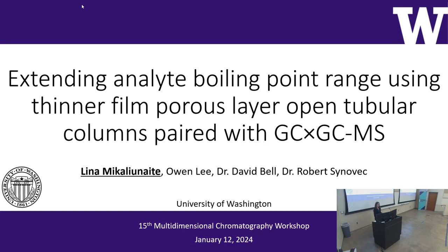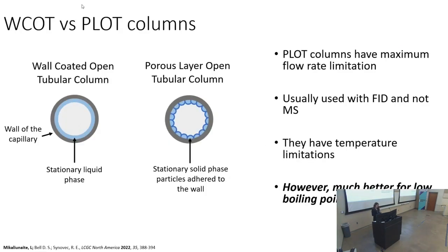To really talk about the PLOT columns and all the work that I've done, I have to go back all the way to the beginning of my research and my time in Rob's group, where we were just looking at PLOT columns for what they are usually known for, which is these light boiling point analytes, and we were just trying to make a two-dimensional system. But first, most of you are probably familiar with the wall-coated columns. That's what we generally use to look at most of our things like fuels and metabolomics. The PLOT columns, on the other hand, are a little different.